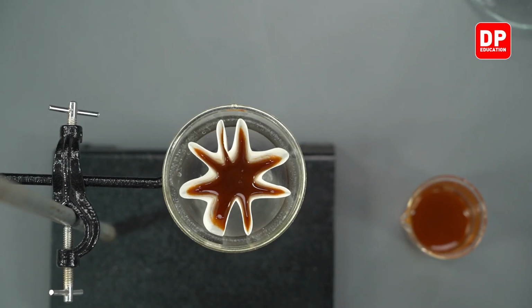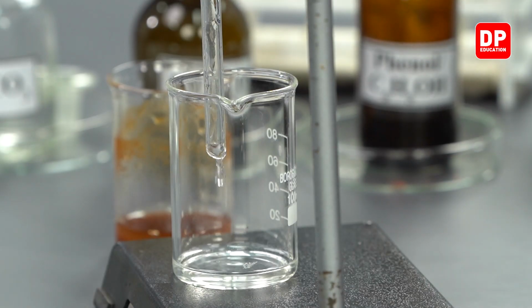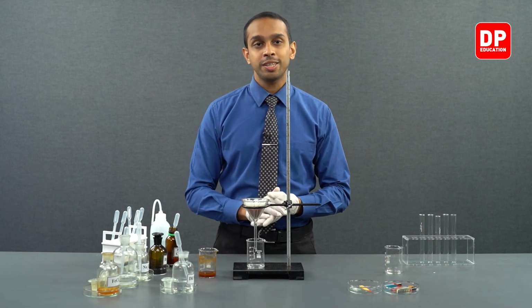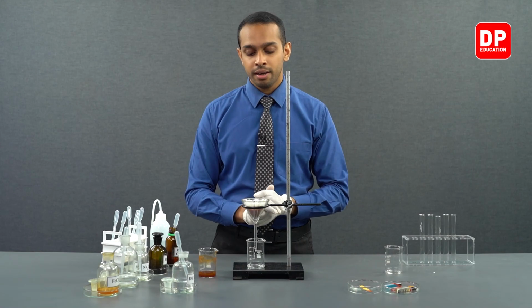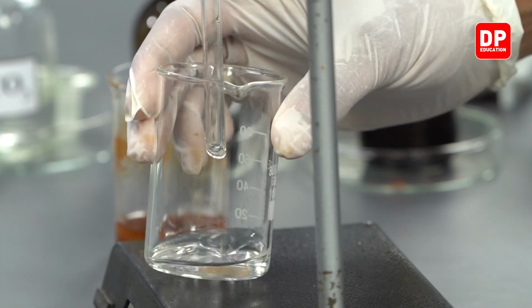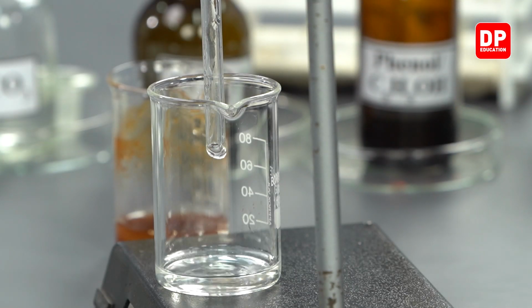As you can see, when we transfer some of our suspension onto this filtering mechanism, you can see the solution is separated from the precipitate. On the filter paper, you will see ferric hydroxide precipitate remaining, and the filter paper will filter out the ferric chloride neutral solution. So, what you have here in the beaker is our ferric chloride neutral solution.